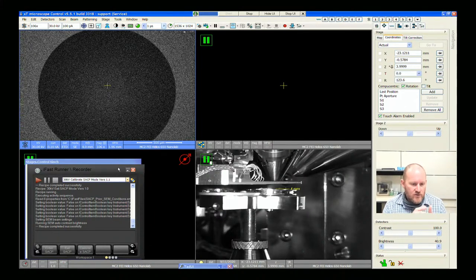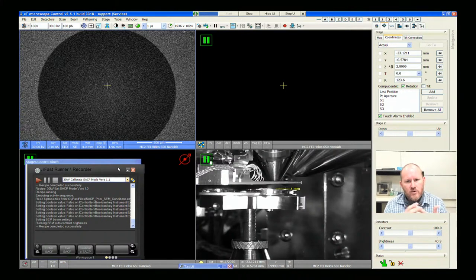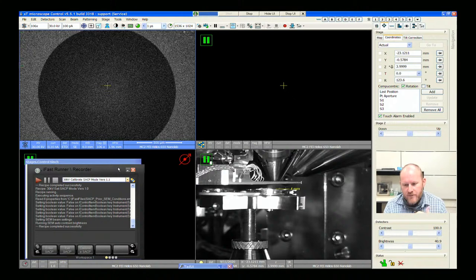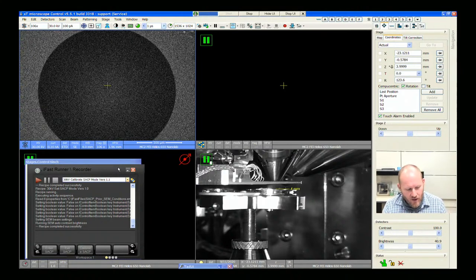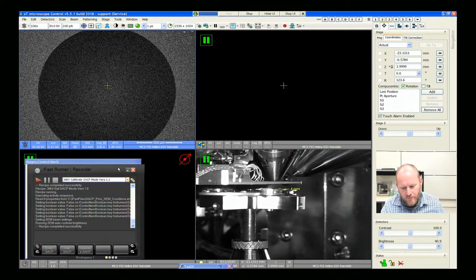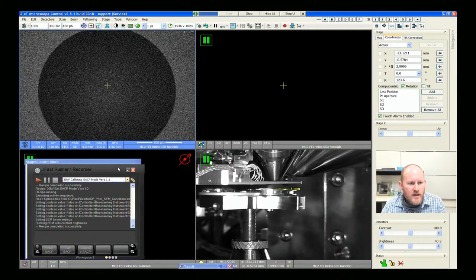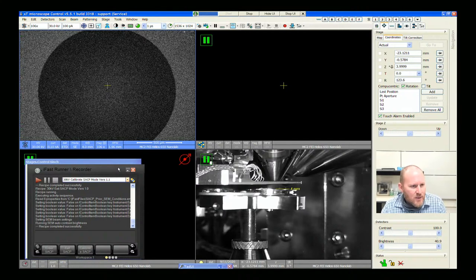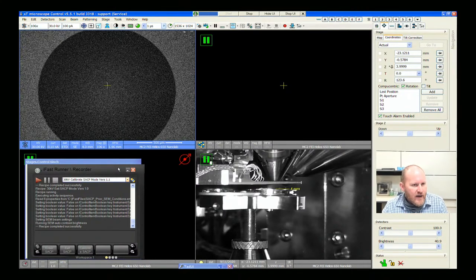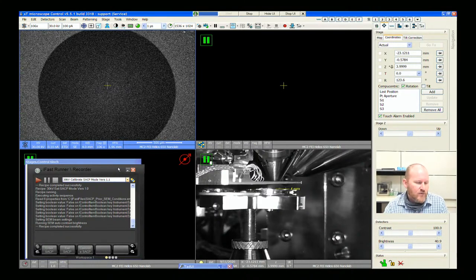First step: we want to turn the C2 off, focus with C1, and remove the aperture. Marty Krimp from Michigan State, Alan Hunter, myself, and Shanub — who I believe is at Max Planck now — have a paper that you can find, I believe in Ultramicroscopy, that actually does lay out the full process. But it's kind of hard sometimes to recreate these from papers.